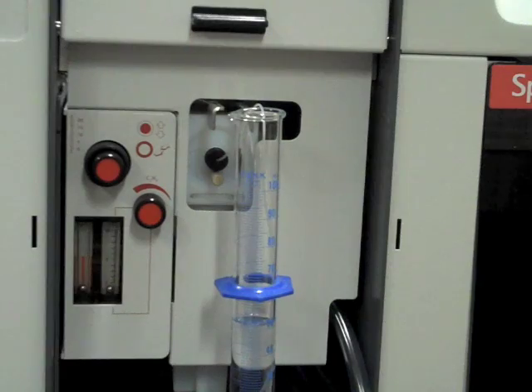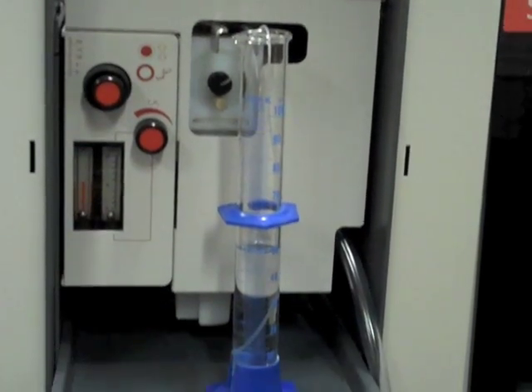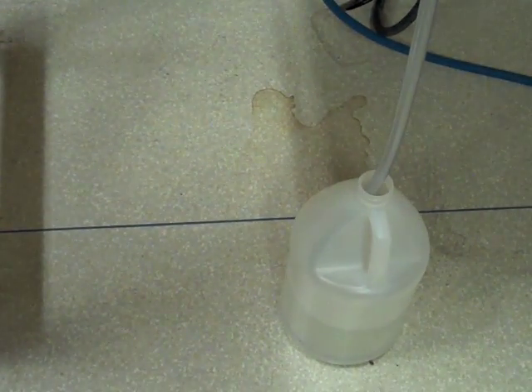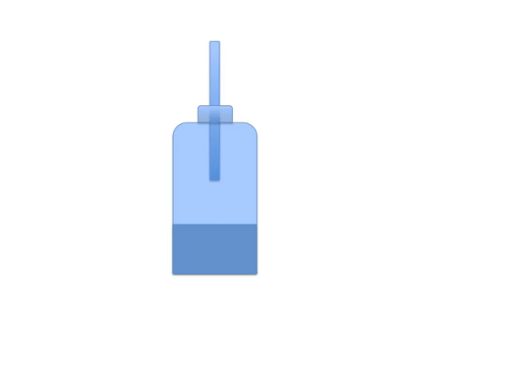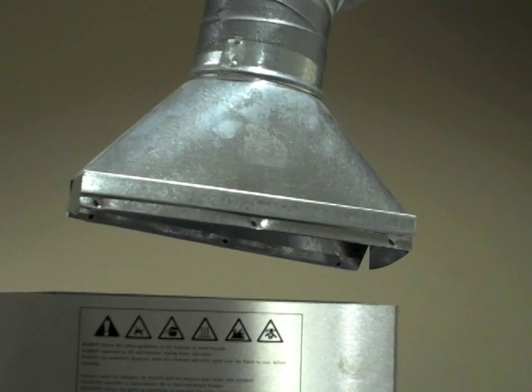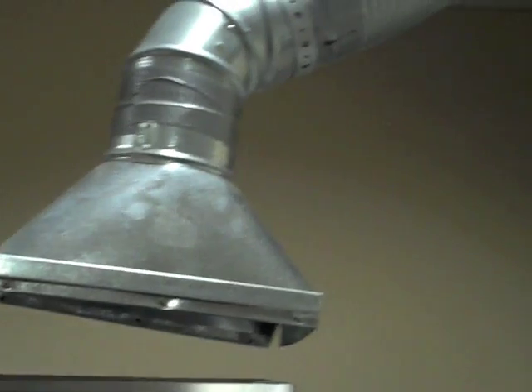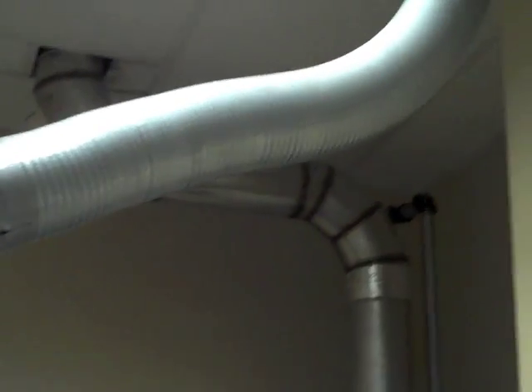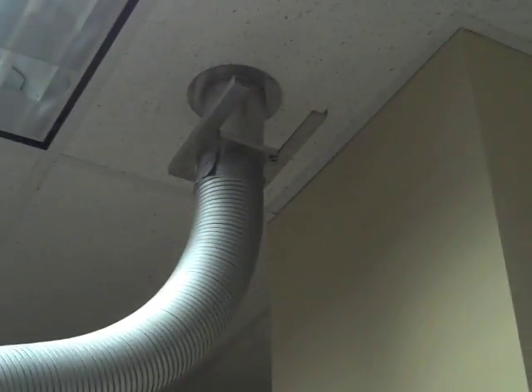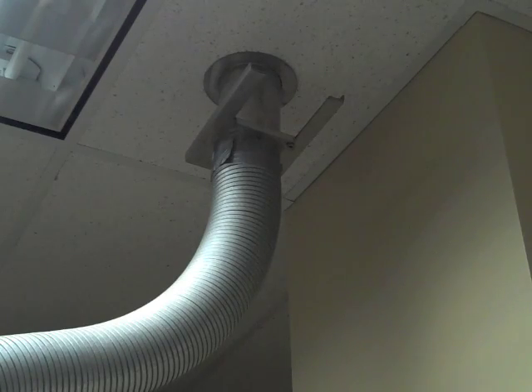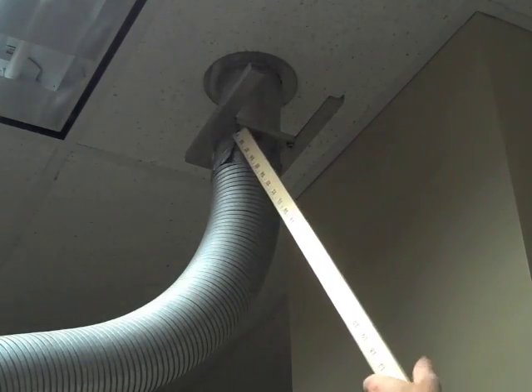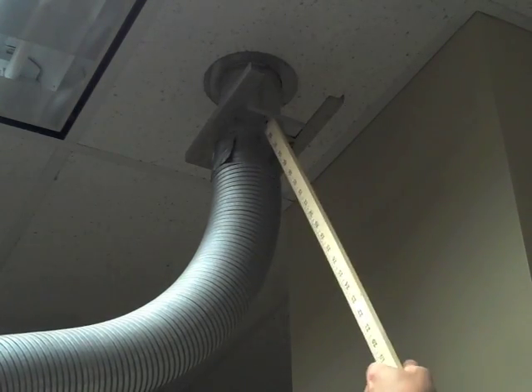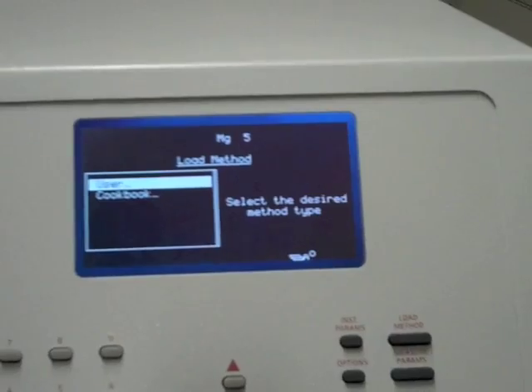Check to see that the drain tube is properly positioned in the waste container. For our instrument, there should be a few inches of space between the open tube and the liquid level. The flame produces gases that we don't want to breathe, so these are drawn off by an exhaust manifold. Open the vent at the ceiling using a meter stick. The mechanism can be a bit stiff, so use the short edge of the stick as demonstrated.